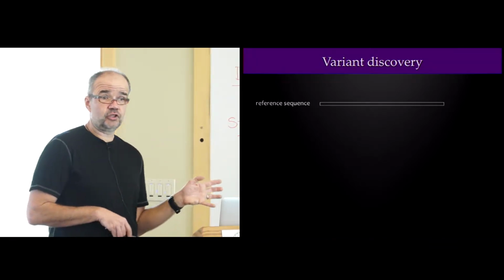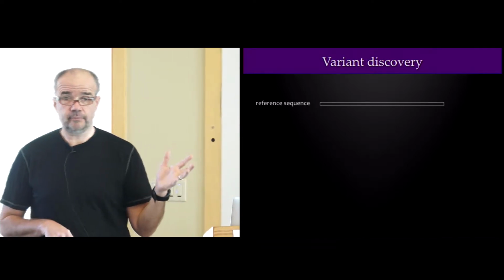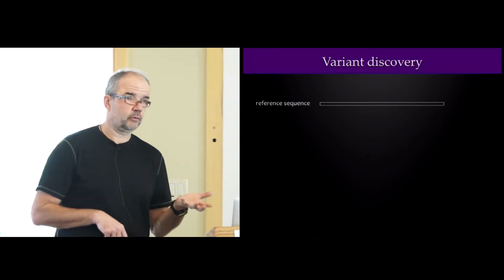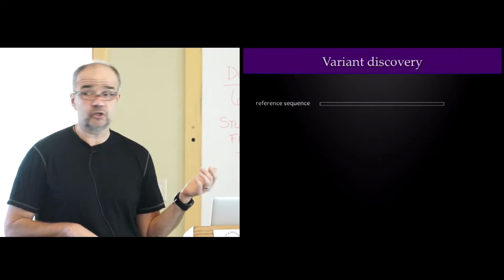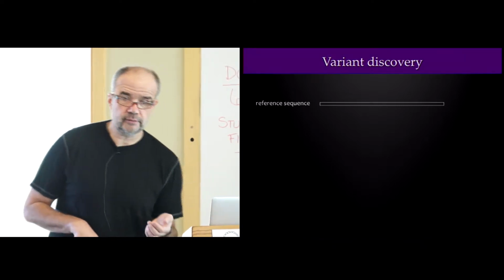The human reference genome is fairly comprehensive, and because it's been worked on for a long time, it's very important. So a lot of resources have been put into it. Some reference sequences from other organisms may be much less comprehensive, or much less accurate, primarily because of the resources that had gone into creating them.